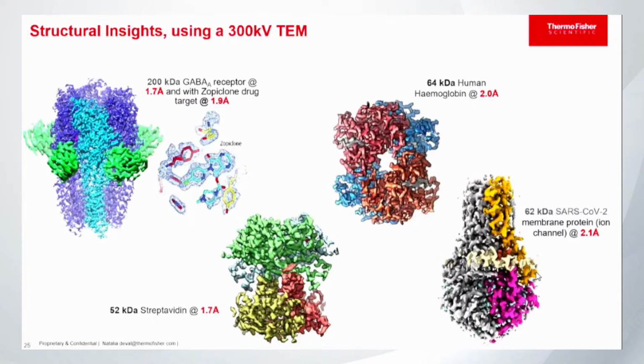This is super important for pharmaceutical companies when they want to develop new drugs, new products, and they want to understand how these products are binding to this protein, okay? And how this is affecting the conformation of the protein.